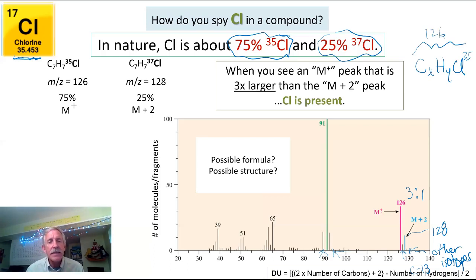And so what I did is I found one that is C7H7Cl35. And that matches my molecular weight of 126 grams per mole. Double check that math for me. I think that matches. So now I have to come up with a structure.